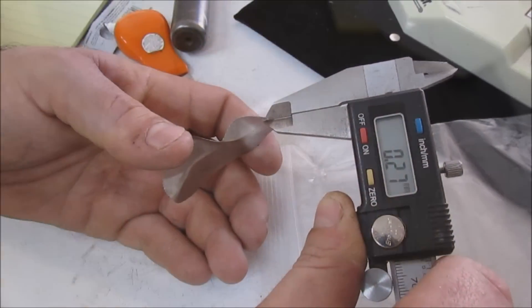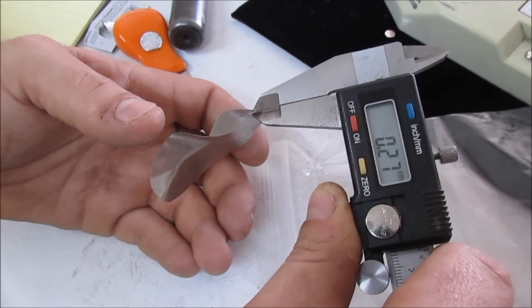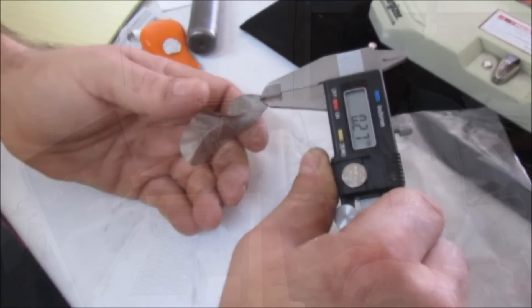It's about like foil now. The measurement is 0.27 millimeters. Cool deal — that should be thin enough.